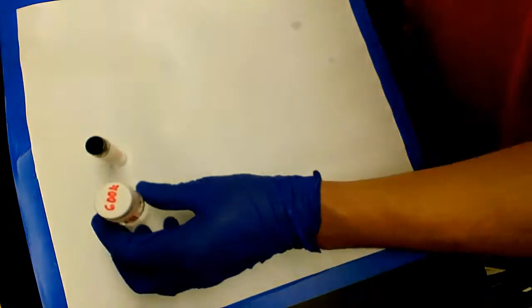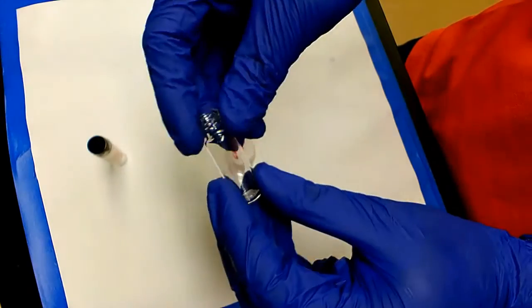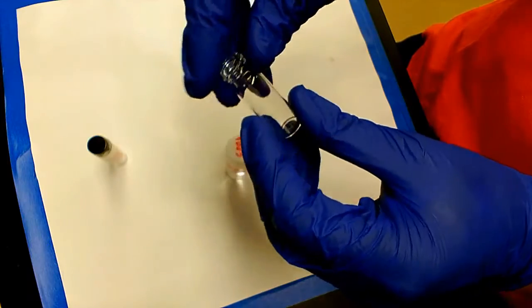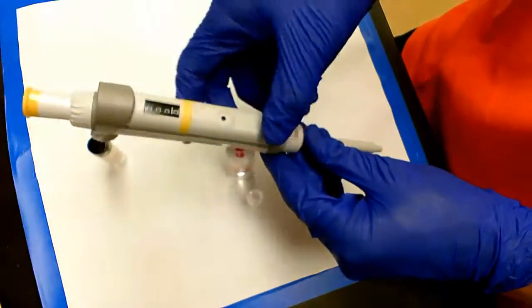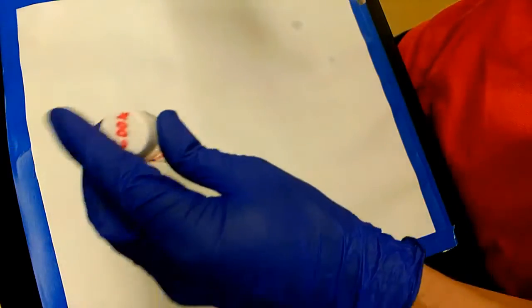So let's get this one out. You're gonna grab one of the smaller vials on the top shelf in one of the yellow containers, and then you're gonna use one of those micropipettes. Use a 200 microliter pipette to get out 200 microliters of this one.